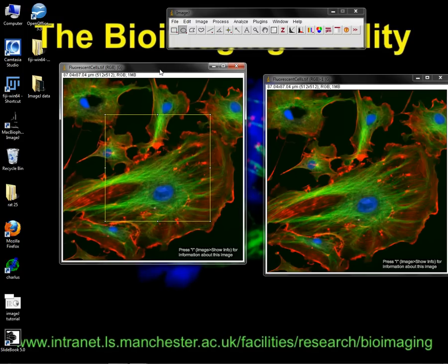So my problem was when I was choosing 300 by 300, if I apply global to set scale, then it shows in microns at the top, not pixels. Oh, okay. If I do 300 by 300 and I set the scale global, it shows the values in microns in the little window. This one? Don't know. That's right. Okay. So once you've got this, you can move your ROI wherever you want.